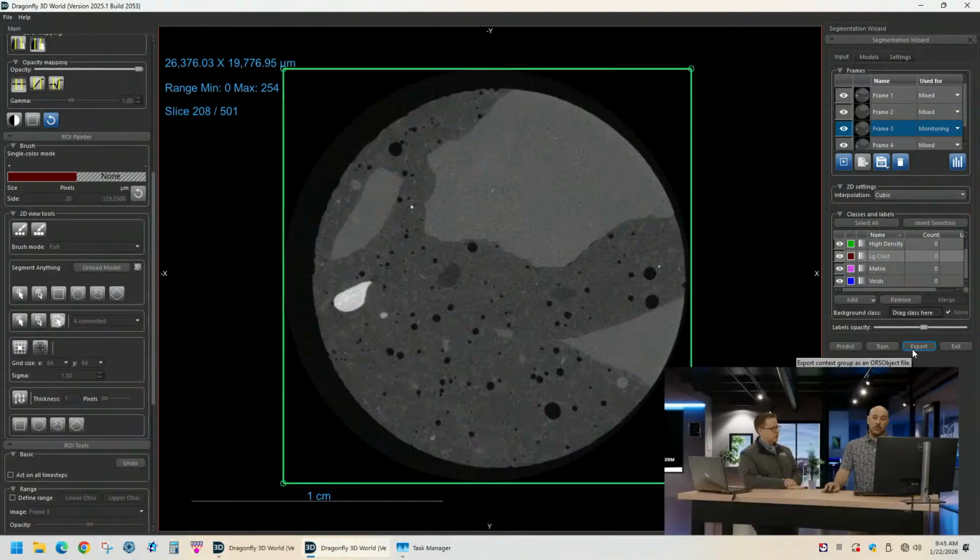Yeah. Okay, so what do we do now? All trained up. We're all happy. So I now have another sample, or I want to do something with it. Well, what do I do now with it? I want quantitative stuff. We want to use it now. Yeah, I want to use this thing.